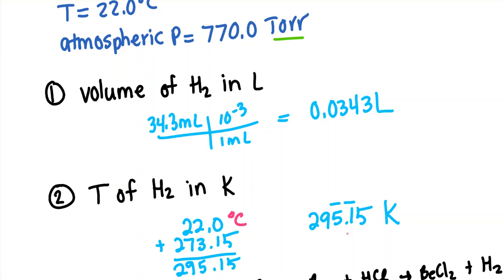And I did keep track of my sig figs, but as you do this experiment, keep lots of digits. I checked, and when I entered a whole lot of digits on the computer, it did not count them wrong if I kept those extra digits, as long as I round off at the end. So keep a lot of digits in there or you won't end up with an answer.